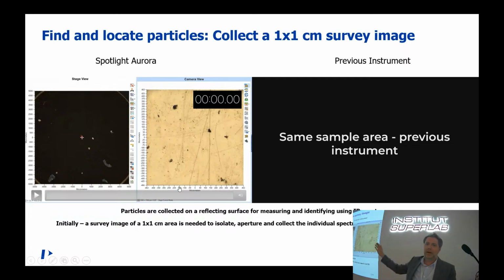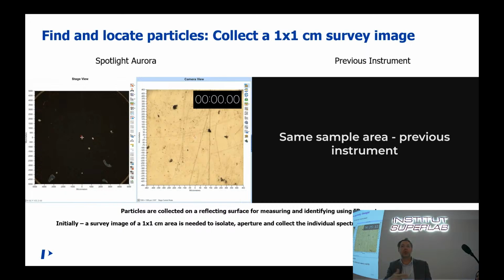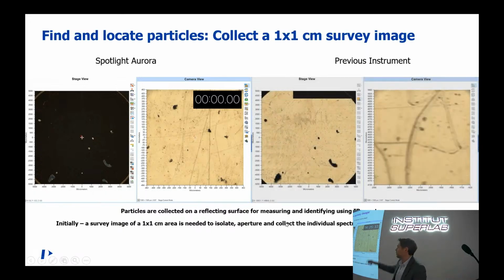So now we come back. It finishes the visible image. So 14 minutes. This is the point now where you do either the automated or manual analysis. All right, which of these particles?